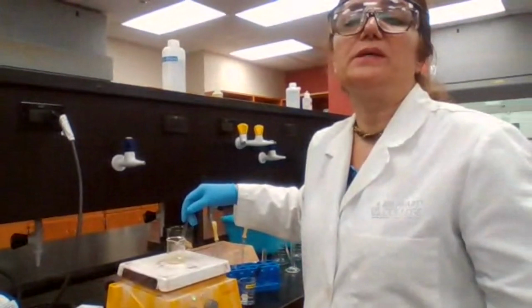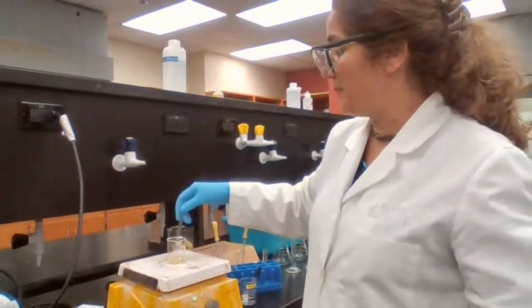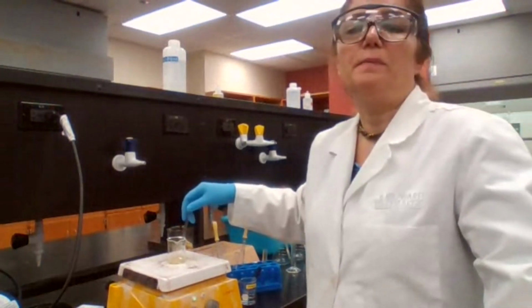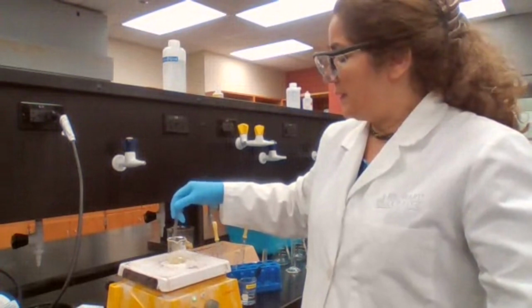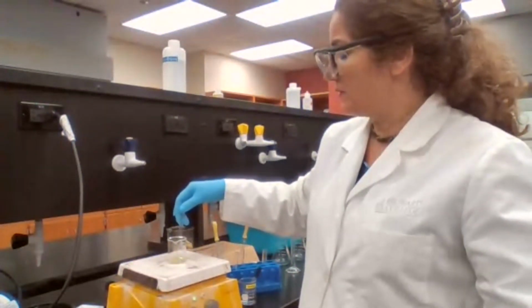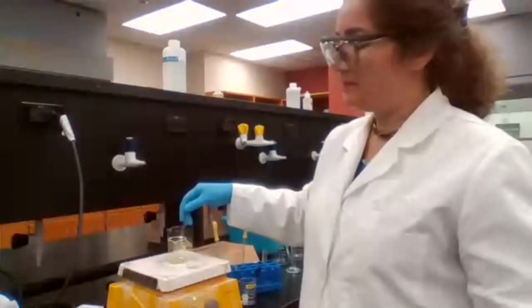Recrystallization process. You are going to dissolve your sample in proper recrystallization solvent at high temperature. Then we leave it on the side to reach room temperature, basically cooling slowly.